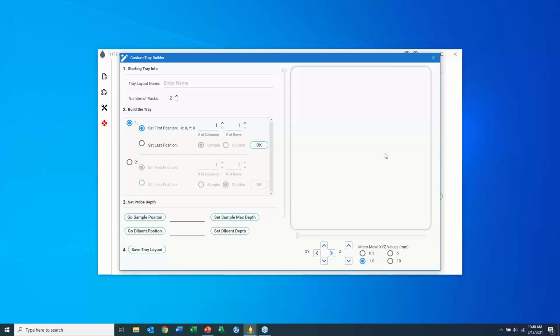The white box on the right is actually a coordinate grid that you can use to map out your vials. Essentially, you just center your tubes, build your own alignment file, set your corners on each rack, and then they will populate in the window to the right, so you can actually build your graphical interface right there, and that makes it pretty easy to interact with.